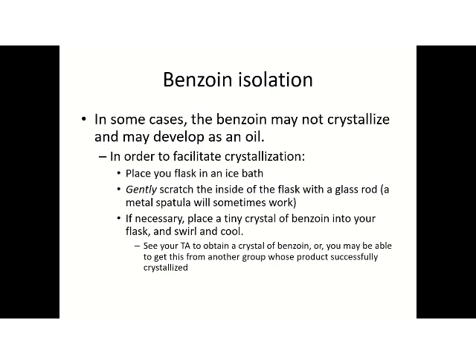Also, low temperatures also increase the crystal nuclei growth, and as a consequence again the purification, right? So all these steps are very important to follow in order to get crystals and a pure product.